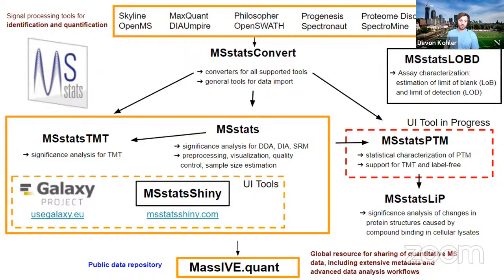So you can see, okay, here is the MSstats required data format, here are the quantification summarization files, and here are our differential analysis files. So it's a way to tie everything together and make everything reproducible and be able to give out the package and data to everybody.